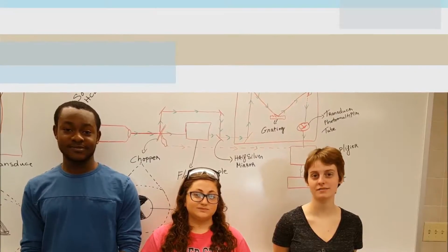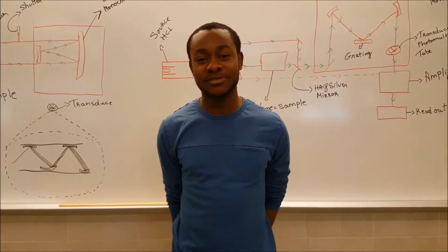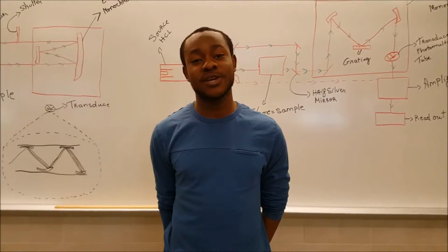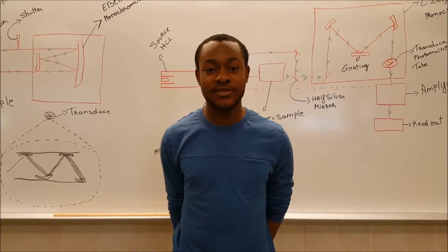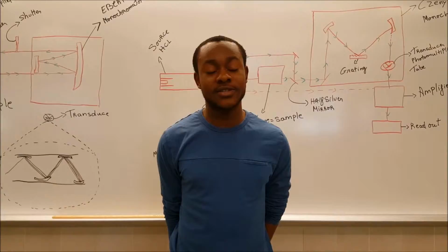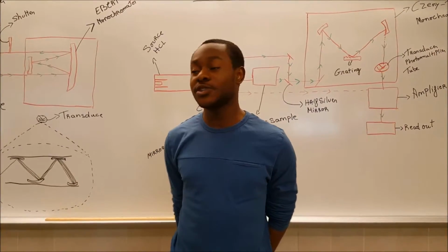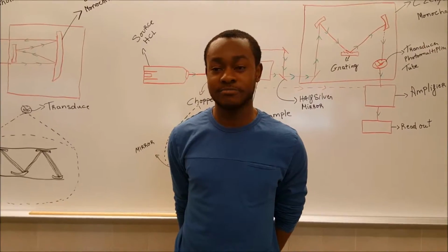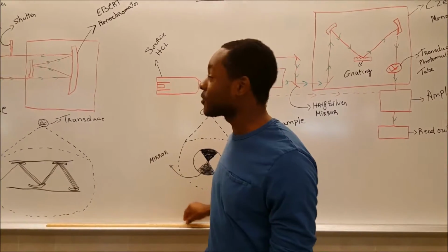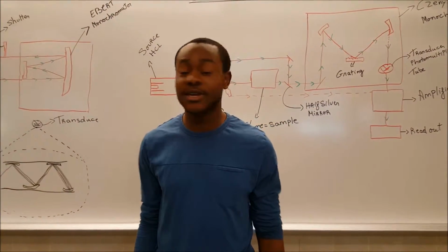Atomic Absorption Spectrometer, or AAS, is an instrument used to analyze iron in samples. We have two different types of AAS, single beam AAS and double beam AAS. Each of them has a different pathway, with slight differences. First, I'll go through the pathway of the single beam AAS.